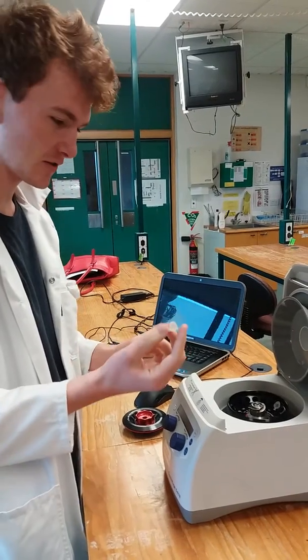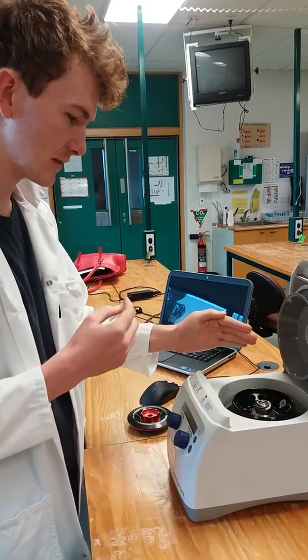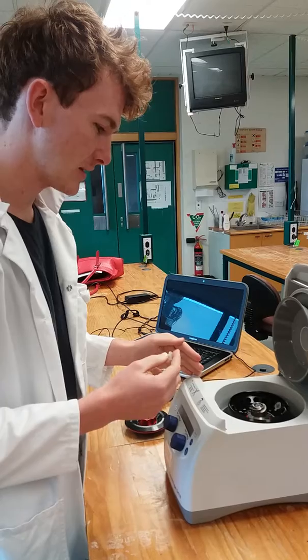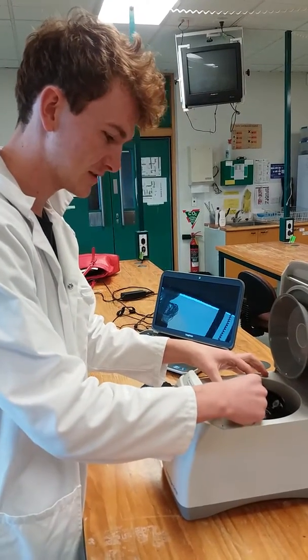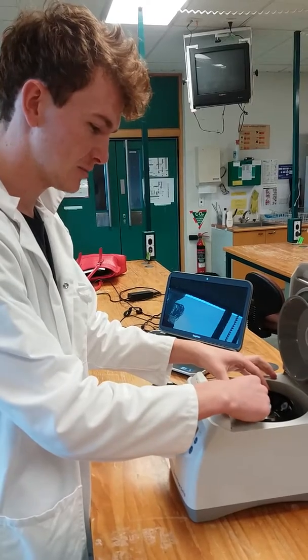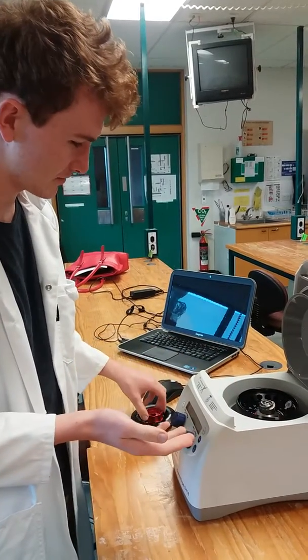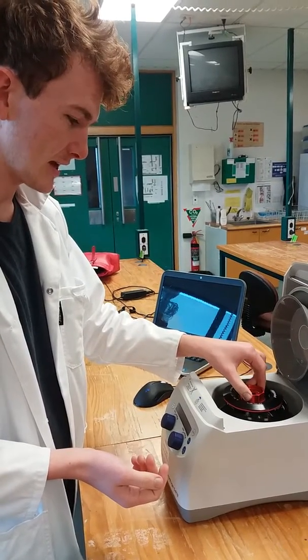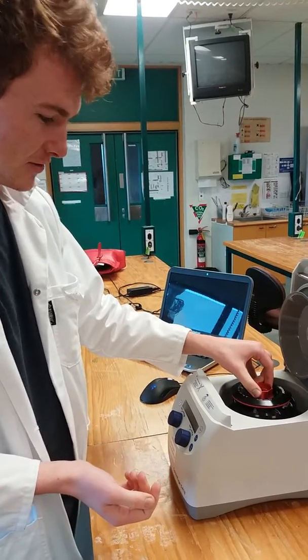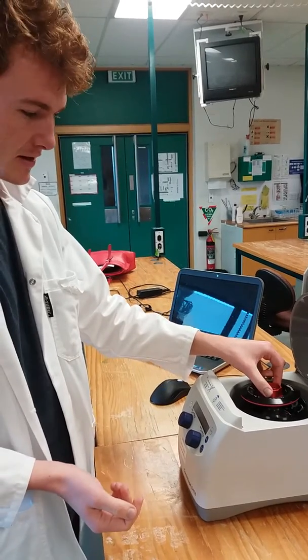You pop your samples in so that they're balanced on either side, and then you turn it on and it makes a whirring sound and spins really, really fast and pushes all the pollen to the bottom of the little sample tube that I've got. Then I can decant the excess ethanol off and then I've got a nice little pollen pellet to analyze at the bottom.